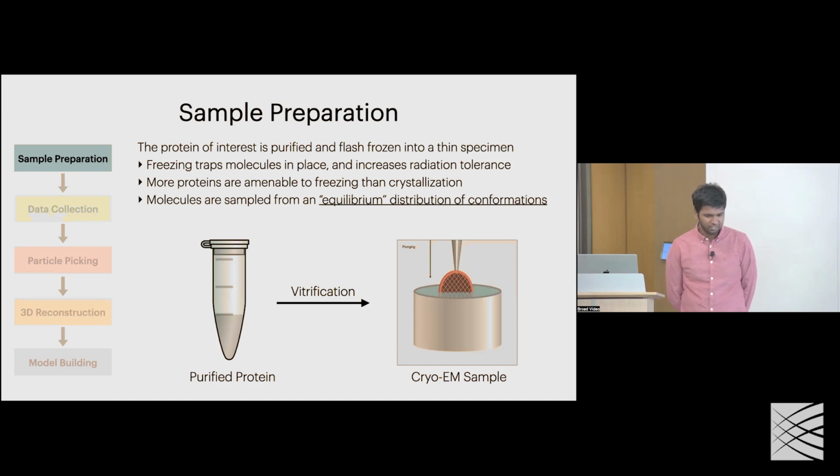Yeah, so in both, for the cryo-EM that I'm presenting here, it's also a similar setup as crystallography, where we're not imaging a cell, we are just purifying a specific protein and imaging that sample. There's an extension of cryo-EM for in situ cellular samples, which I'll talk about. Okay, I see. Thank you.